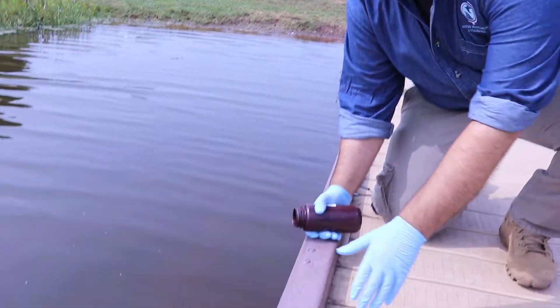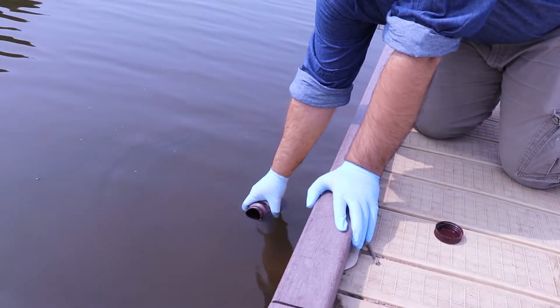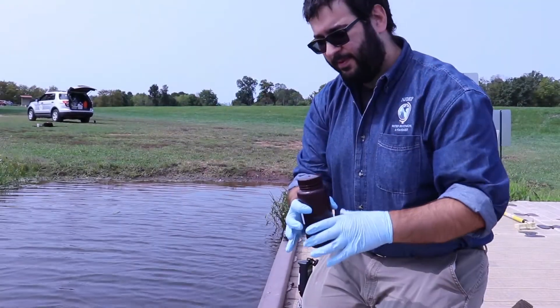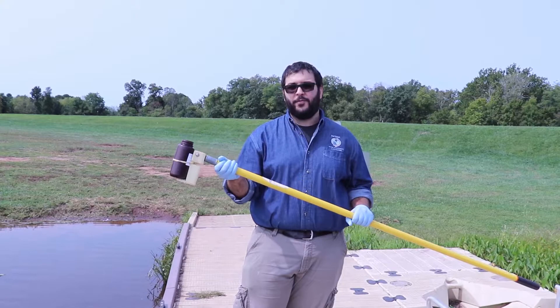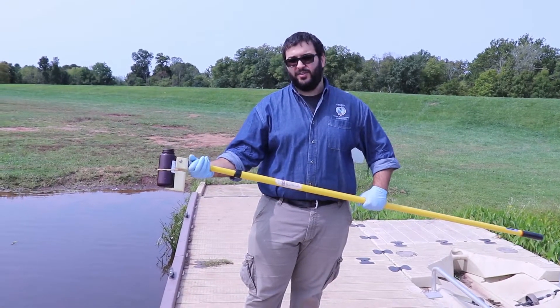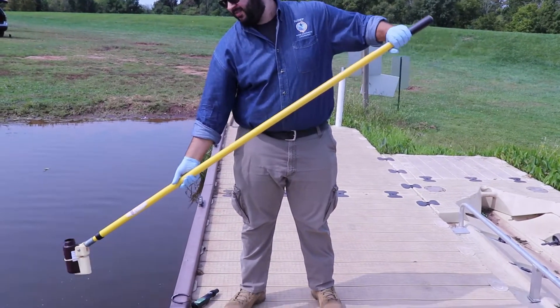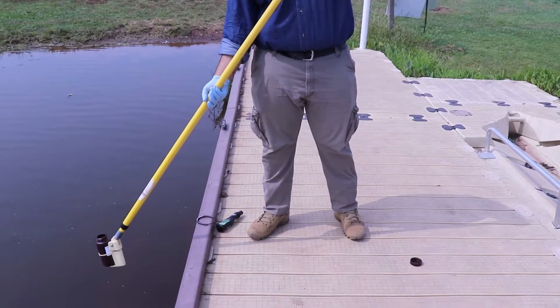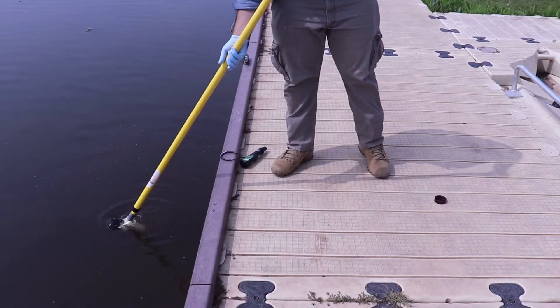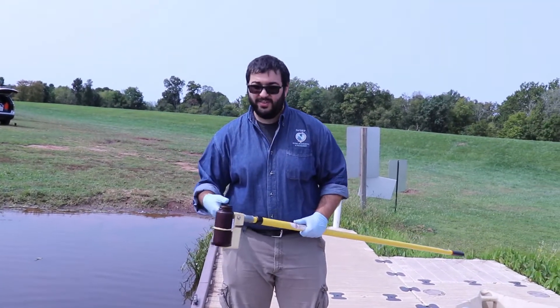Once you've done that, take your bottle and dip it into the water, submerge it, and try to fill it three-fourths of the way. Then cap it. If you have a sampling pole, it will be very helpful in situations where accessing the water is difficult. You simply submerge the water bottle until it's filled and then cap it.